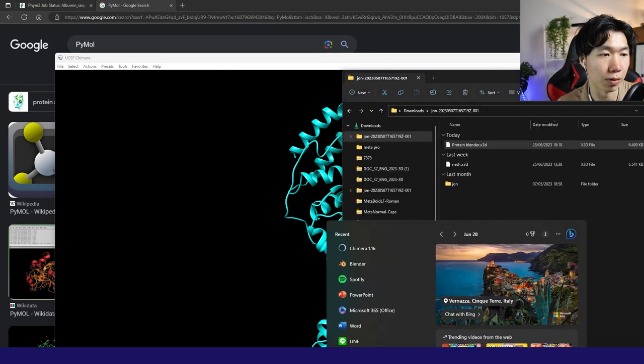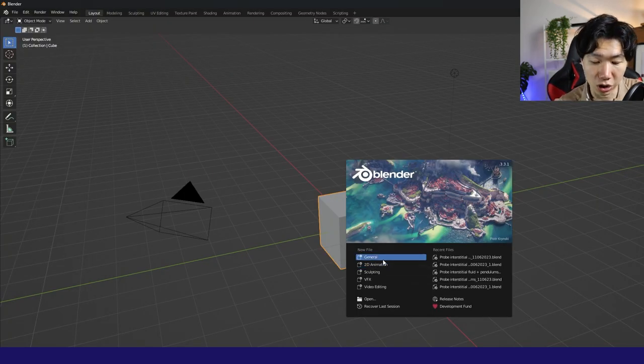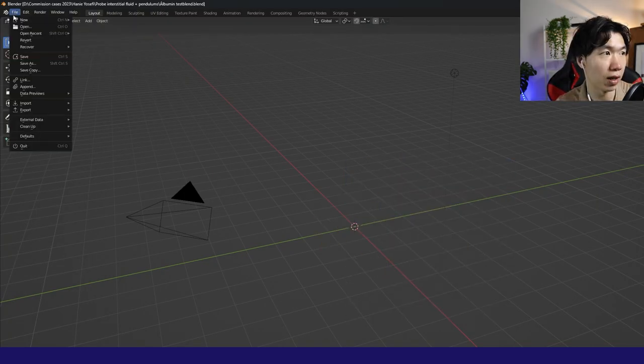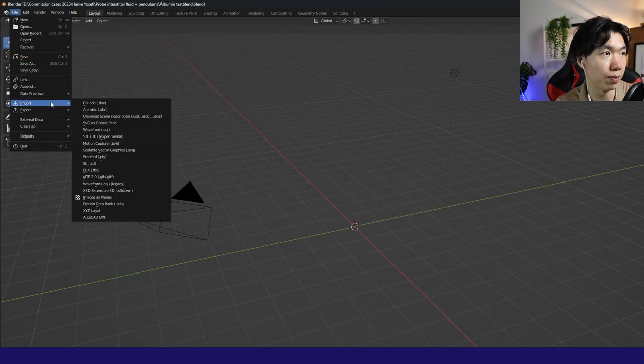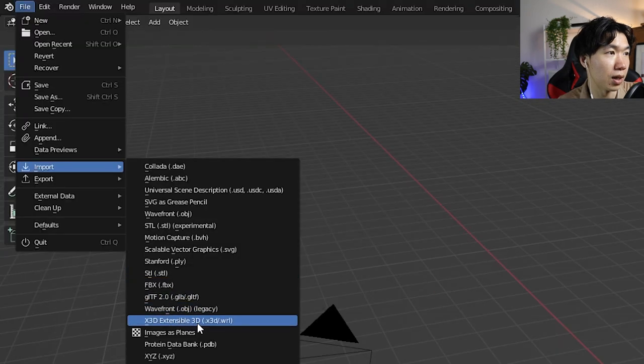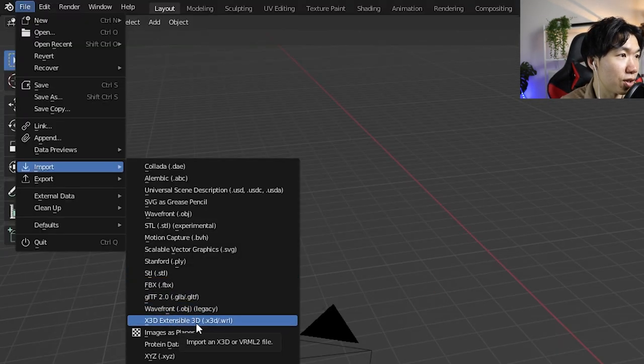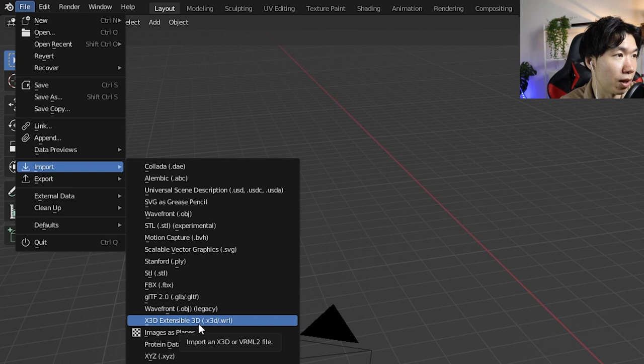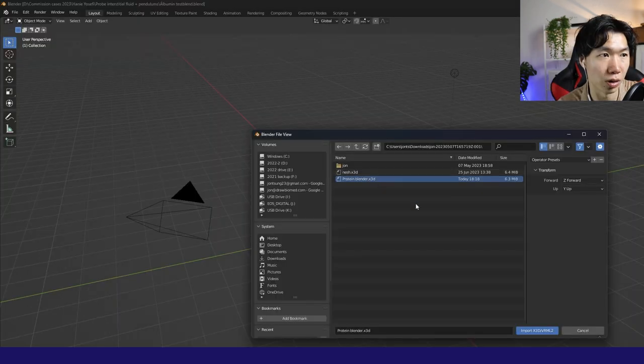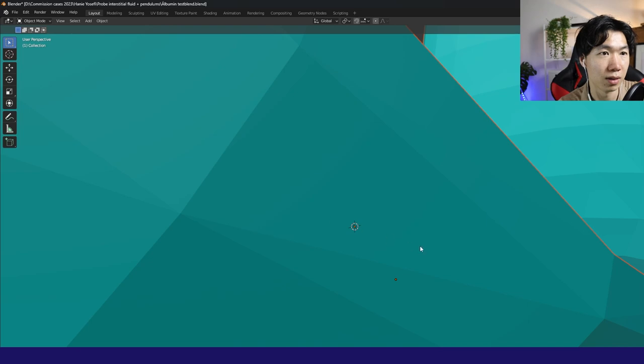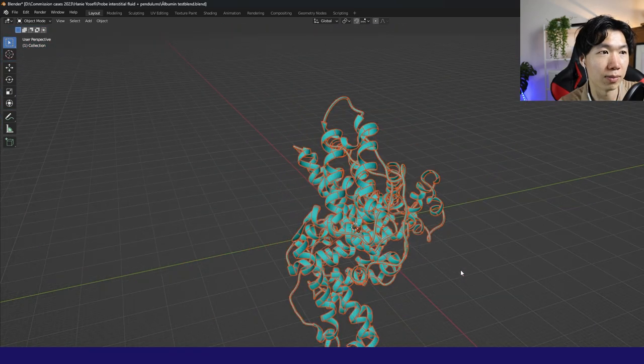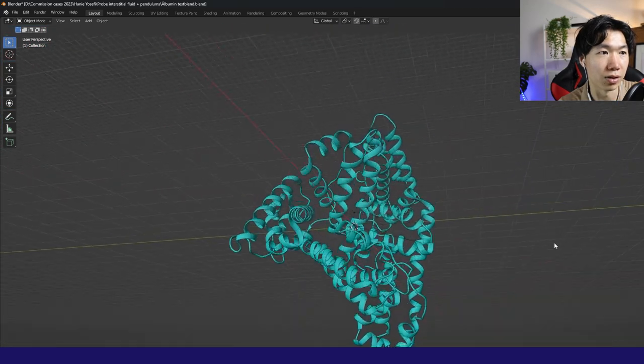Now we can import it into blender. Blender is an open source 3D software. It is really good. So go to file import. And choose X3D extensible 3D file. Choose your X3D file. Import it. And you will have the model in blender.